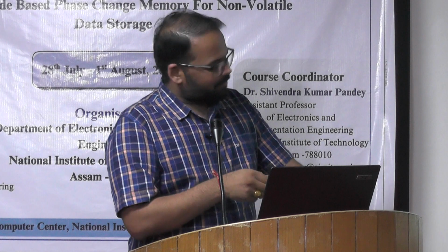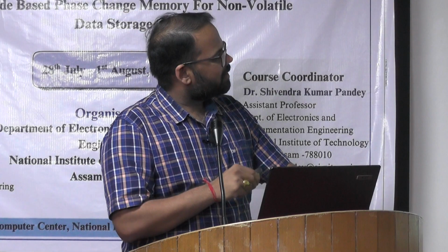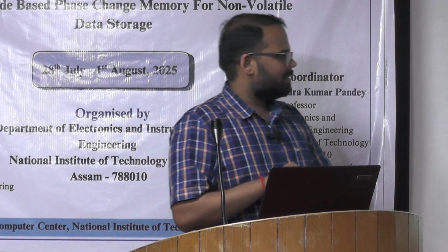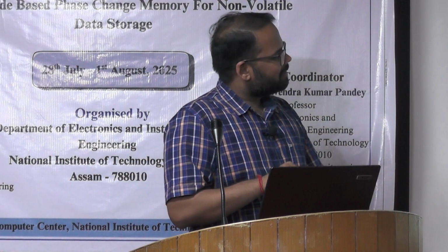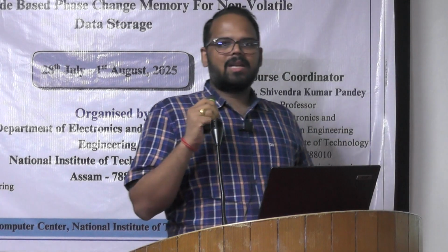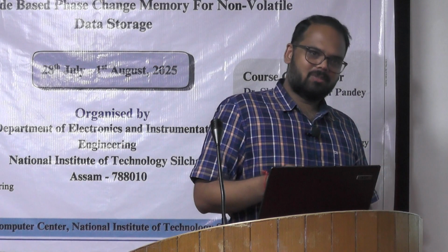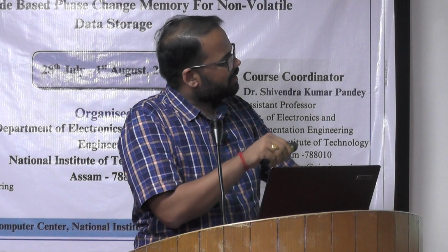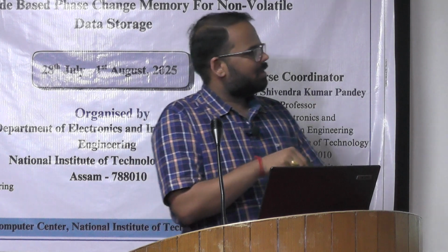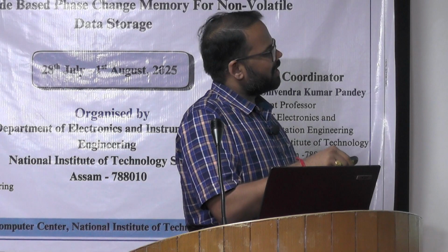So here, what we are doing in this case is using a kind of switching matrix, a low cost switching matrix. You can simply use the relay, and you can control this with data acquisition. With this setup, you can connect your one SMU, and it provides the benefit that you can change the terminal. So here these connections are coming for your source and sense, and here it is going to your sample. Through this NI based data acquisition, you can control it.